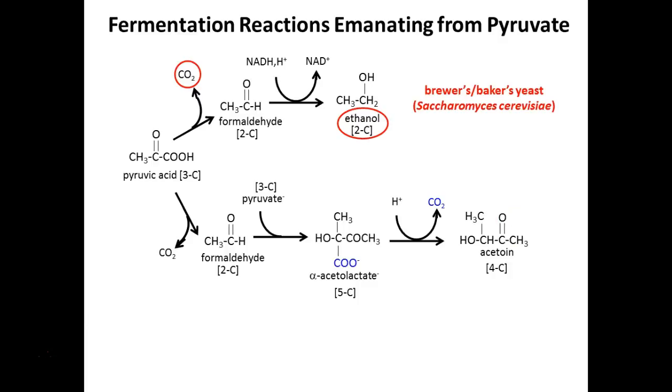Yes, as an answer to one of your questions. One of the tests we performed today was testing to see if the organism produced acetoin, because it can later convert it into 2,3-butanediol when it adds the electrons to it.